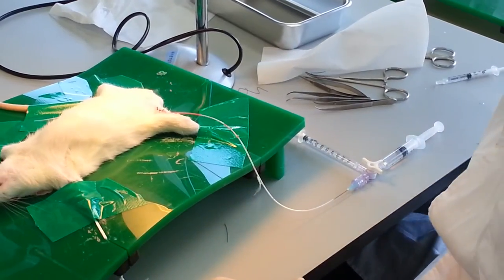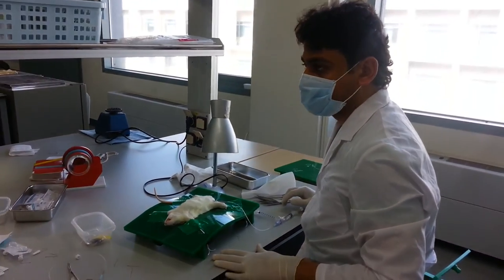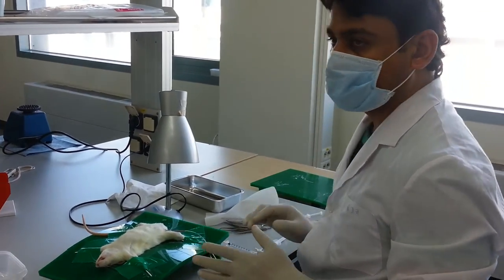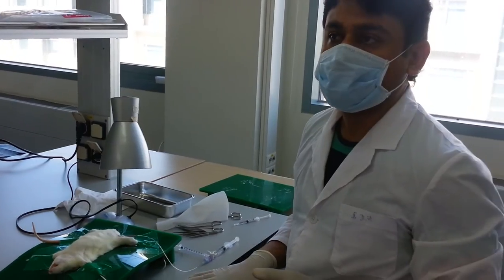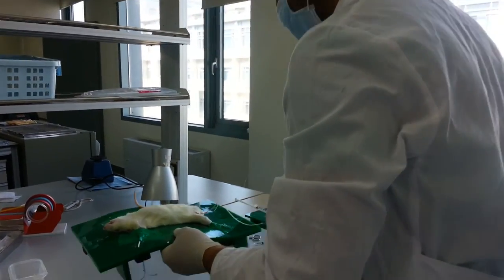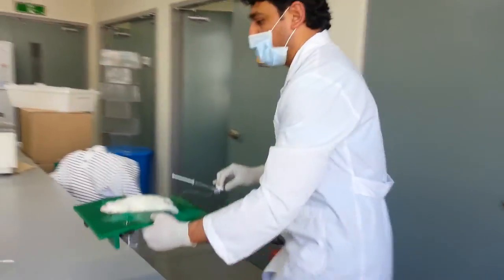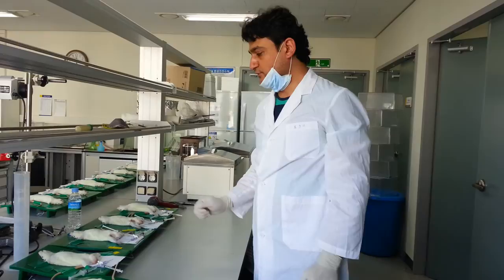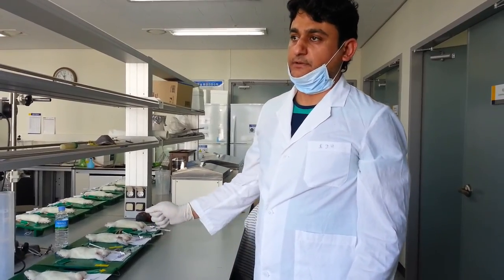We have finished our work. We made this video for the educational purposes of all students who will be doing animal studies involving cannulation of the rat vein as well as artery. This work was done in the lab of Physical and Industrial Pharmacy at Huntig University, by a group of Pakistani and Korean students. If you have any questions you can follow us and ask on our website.